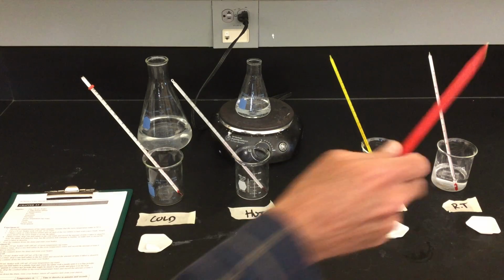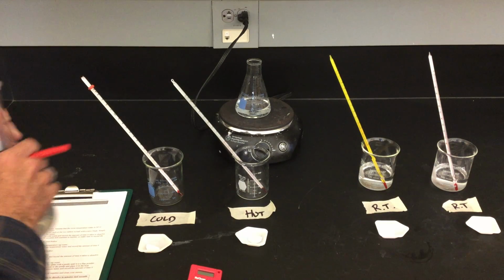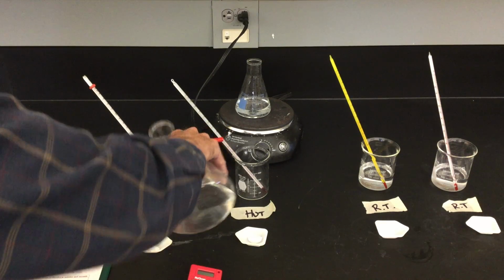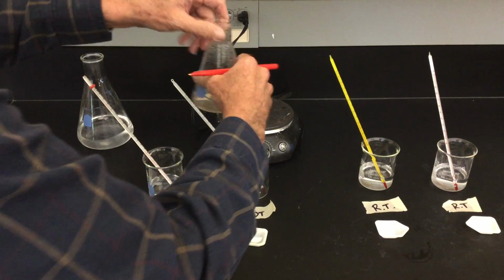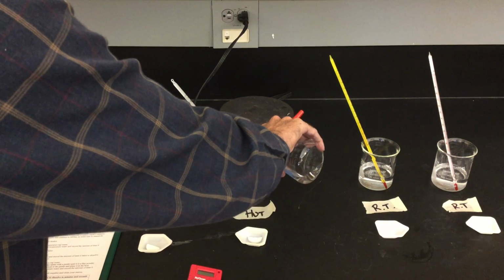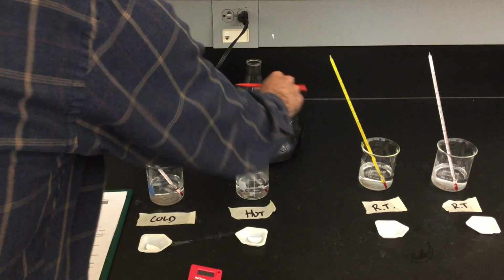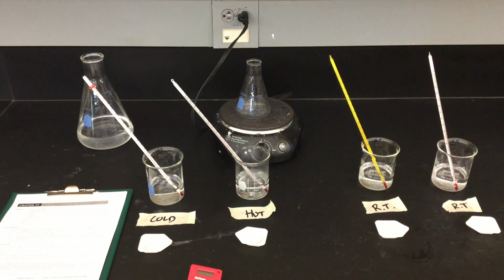So I've already done the whole setup for us. What we do need to do is record the temperatures. So I'm going to pour in 100 milliliters of water in each of these samples, and we're going to record. So there's 100 there. There's already 100 milliliters of water that's been heating. And the last two contain room temperature water. So we'll take those temperatures as well. We'll start with the room temperature ones.